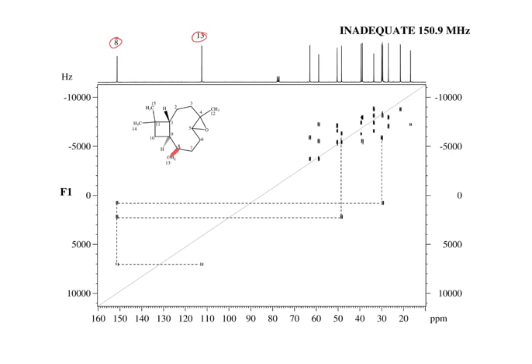All right, so we could start there. Of course, the terminal one, C13, only couples to one carbon, right? So it couples down here to C8, and notice the 8 couples to 2 other carbons. So let's say that one of them is going to 9.